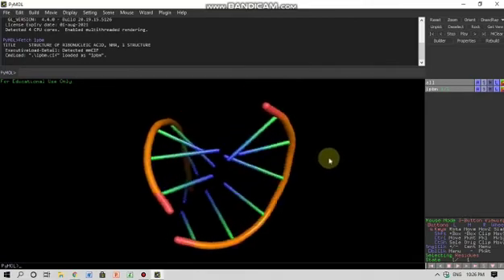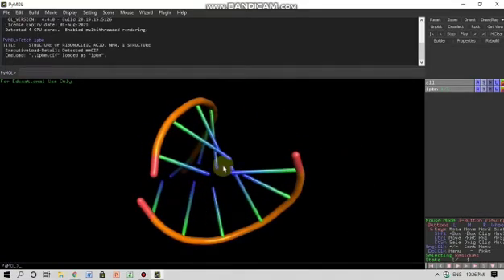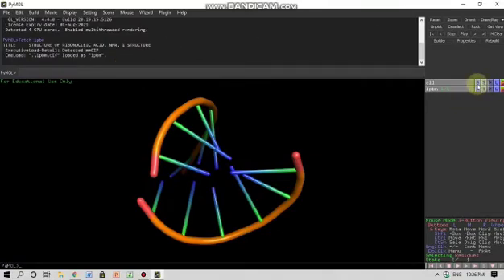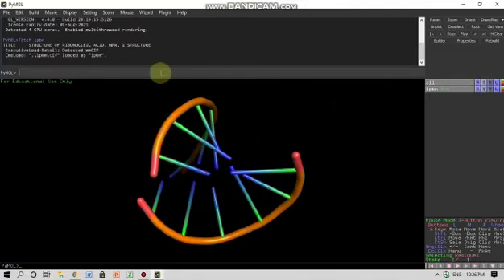Okay, so as I told you earlier, there are two approaches: whether you write the commands here in the command line or you can change things by clicking here by action and show and hide and label and color. So by writing things in the command line I find easier.